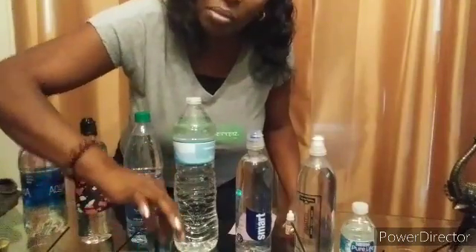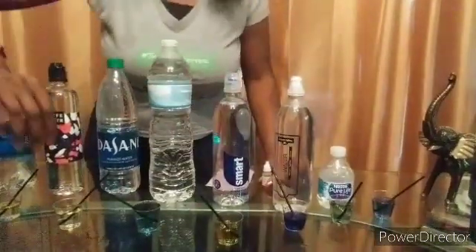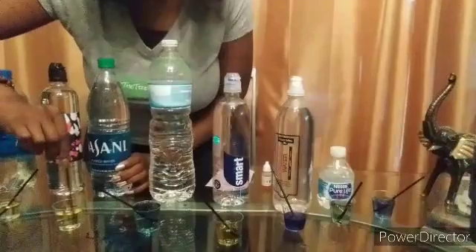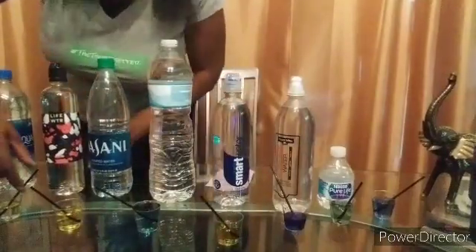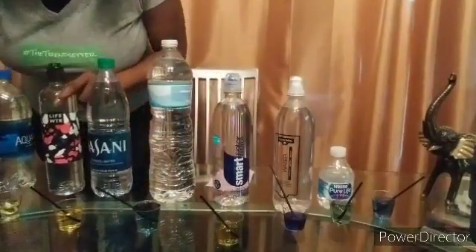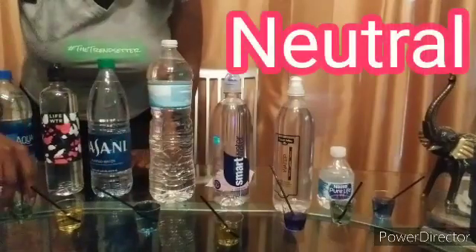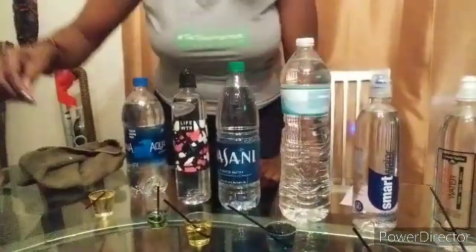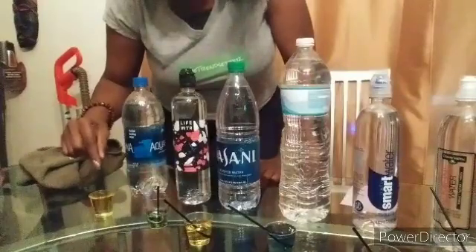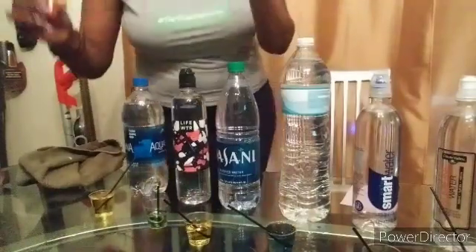The spring water is pretty good, guys - I hope you can see that. Let me hold it up so you can see. This one here is the Dasani - you can see that the Dasani is yellow, that's like pee-pee, we don't want that. Then we're going to move on to Life Water - the Life Water is greenish, kind of okay. And then the very last one is the Aquafina - look at that, that's not good either, that looked yellow too.